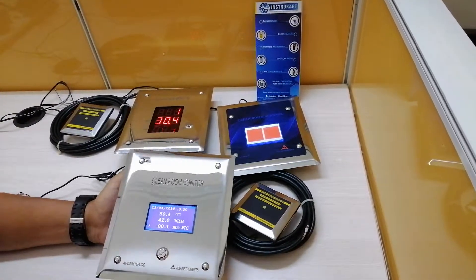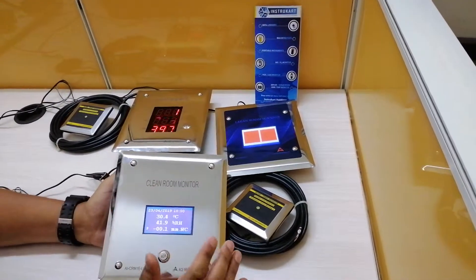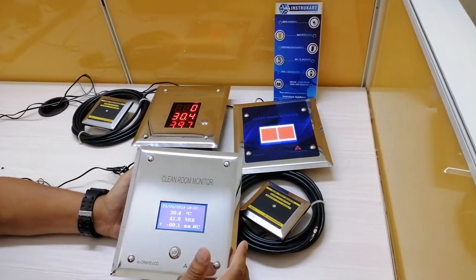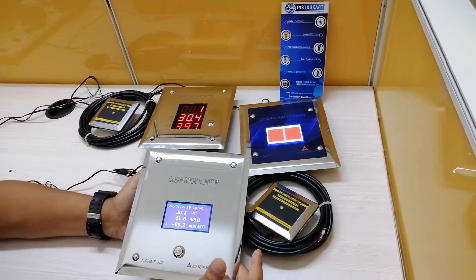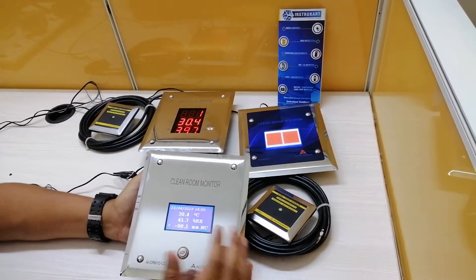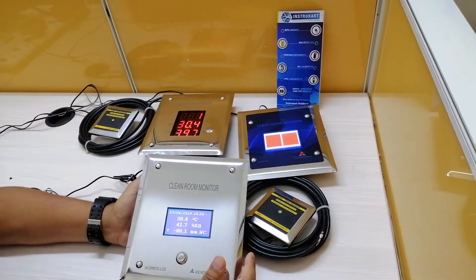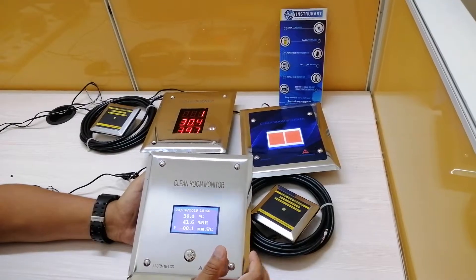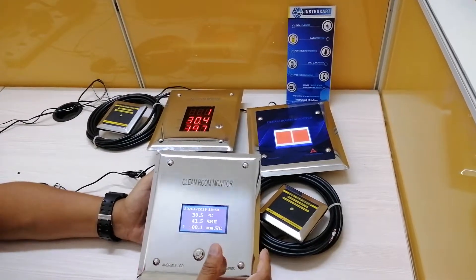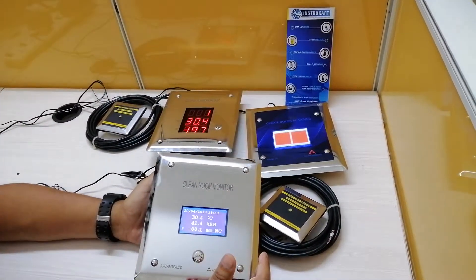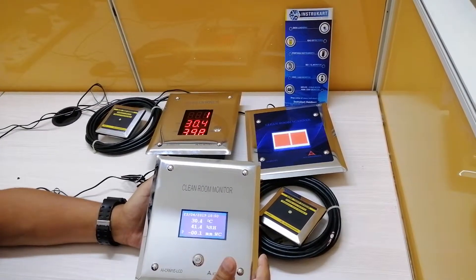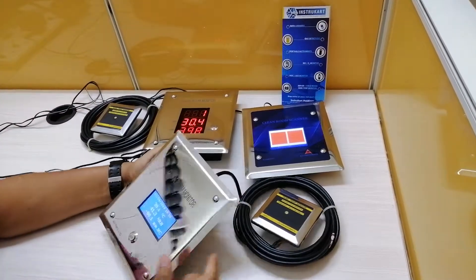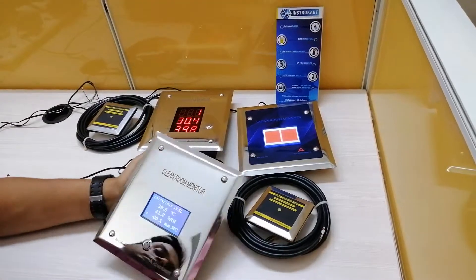There are several customization options. The basic communication protocol is RS-485 and it has 4 to 20 milliamp output for all three parameters, so you can connect to your PLC SCADA with the RS-485 Modbus protocol with the help of these glands.